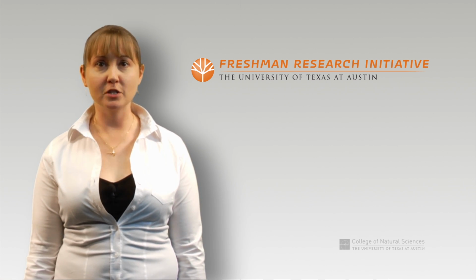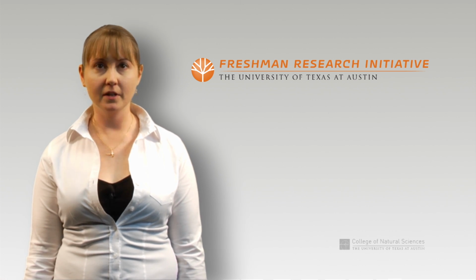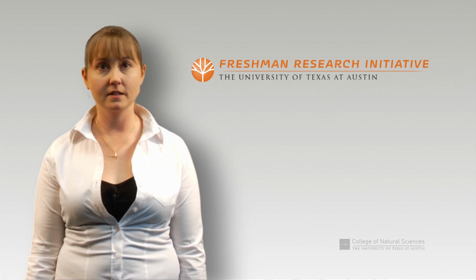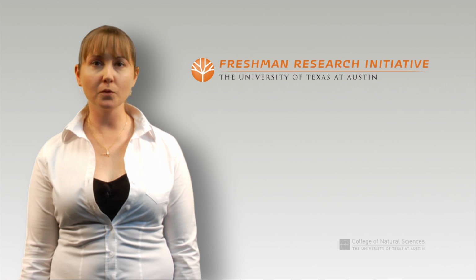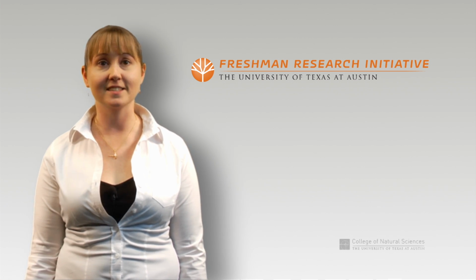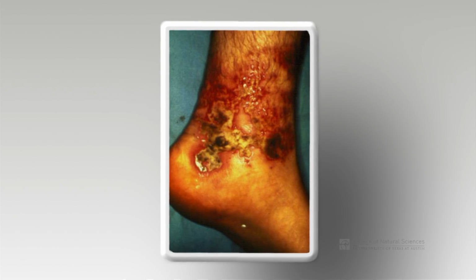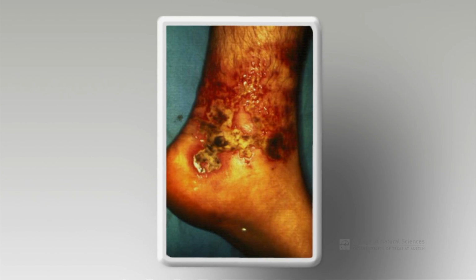Being safe in the lab is your personal responsibility. There may be times that people in your lab, even senior laboratory members, are not adhering to safe practices. Some labs may be lax about safety, but even if graduate students or postdocs are wearing flip-flops in the lab, you can make your own decision to wear closed-toed shoes and stay safe. This picture was taken after a lab user wearing flip-flops in lab accidentally spilled acid on themselves. The lab user suffered severe burns.